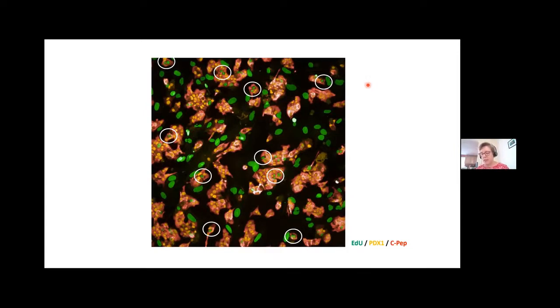What we did find is that for readouts like survival, it's sometimes good to give them one more day to adhere, to settle down. It's not scientific really, but they spread out and seem to get more comfortable. We haven't found that to be the case in proliferation, but in other readouts sometimes that is true.